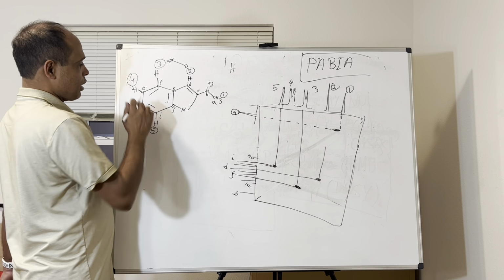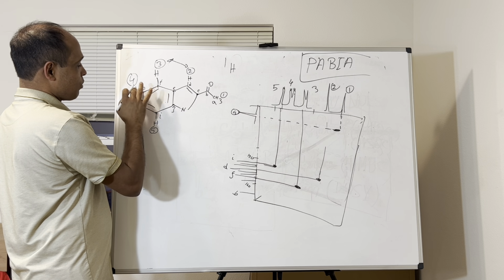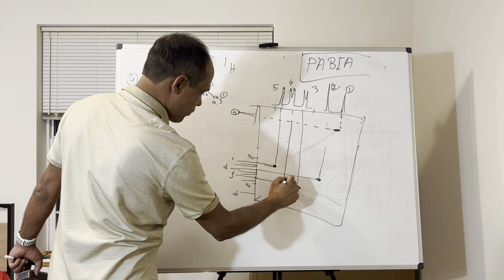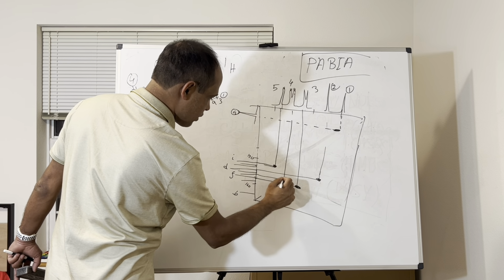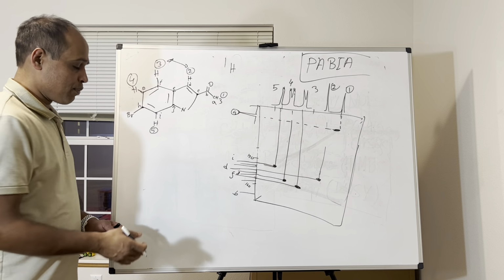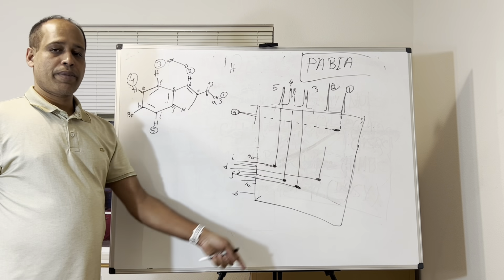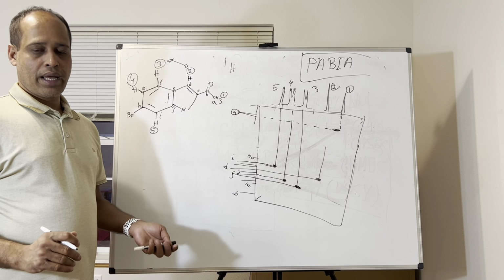And the G carbon has a proton, number 4. So you can see maybe this. Okay, there is a correlation, so you can say this is G. As long as you have the proton, those carbons will show the cross peak, other carbons will not. So this is the HSQC.